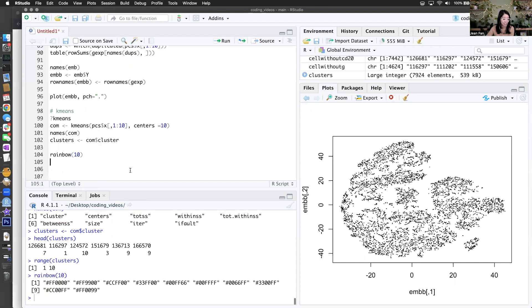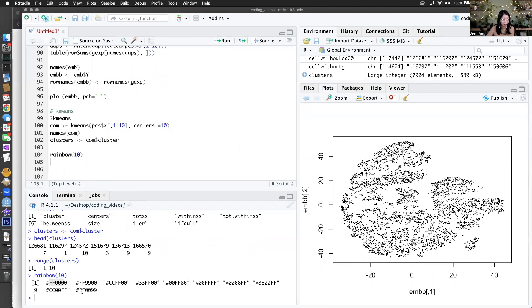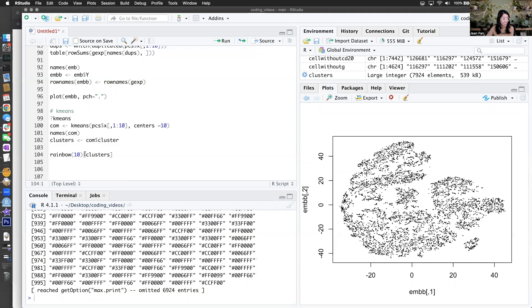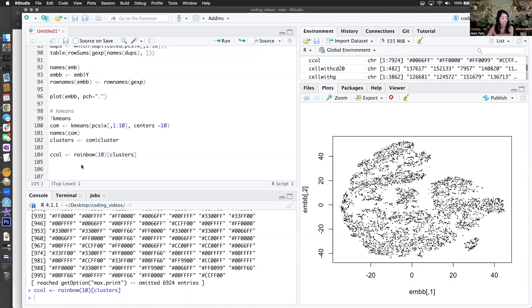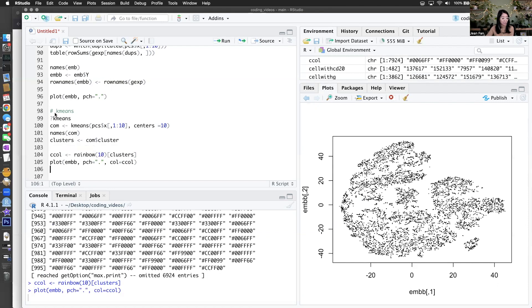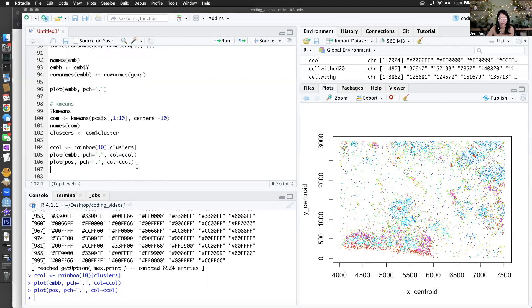I need 10 colors, which I can get via rainbow. These are different colors. I want to map my clusters into these colors — so these are my cell colors. I want to plot the embedding colored by my cell colors. Let's see if this works. Oh nice — so I have my pink cluster which is the one I was trying to isolate. I wonder if I colored my positions by these transcriptionally distinct clusters, what would they look like? Oh cool, neat — looks like there are some spatial patterns, and it'll be up to the students to investigate what underlying biology this might mean.